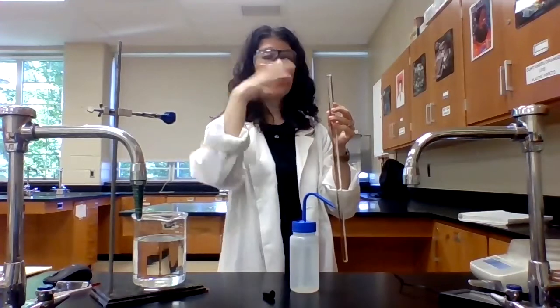It's really important that I completely fill the eudiometer. I don't want any air inside it, because that would increase what I would think is the volume of hydrogen gas. I want any gas inside this eudiometer to be just hydrogen.